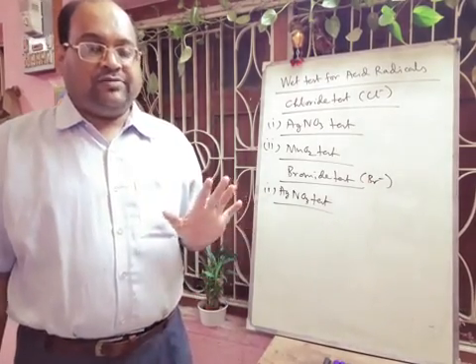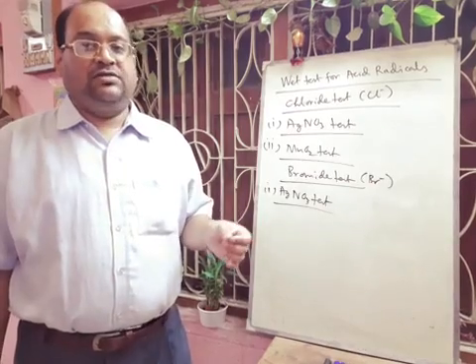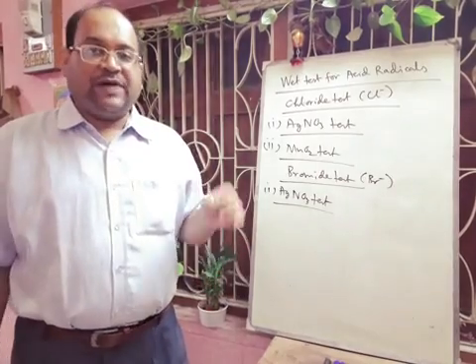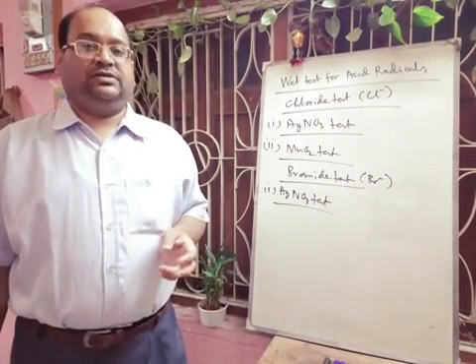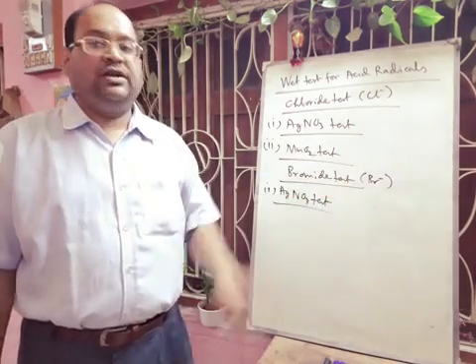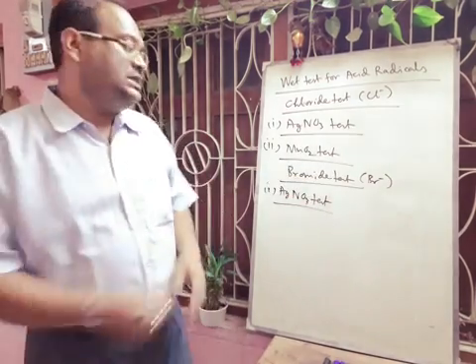Okay, it is not a white precipitate, it is pale yellow, very light yellow. Precipitate of silver bromide will be formed, which is partially soluble in ammonium hydroxide. Okay, and in this way we can confirm that your sample contains Br minus. Next test is the MnO2 test.